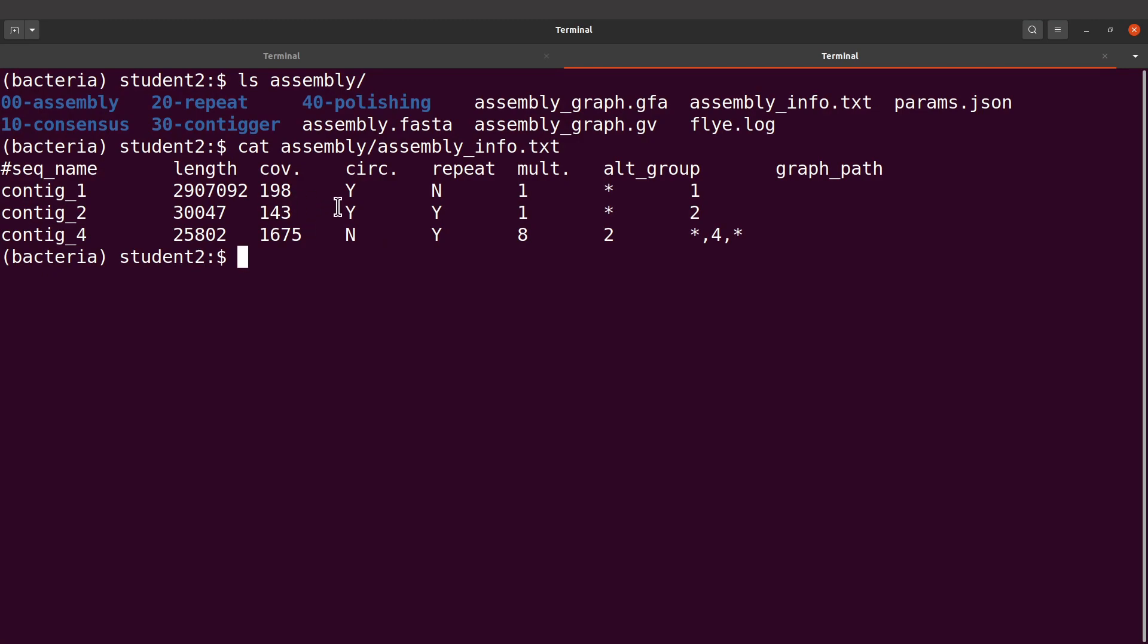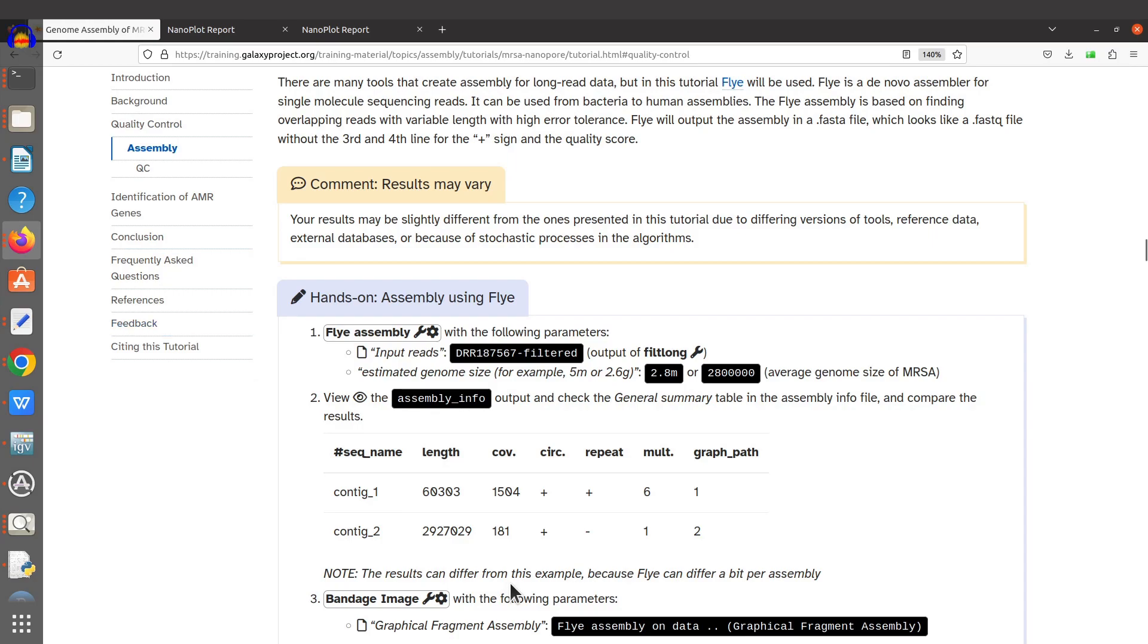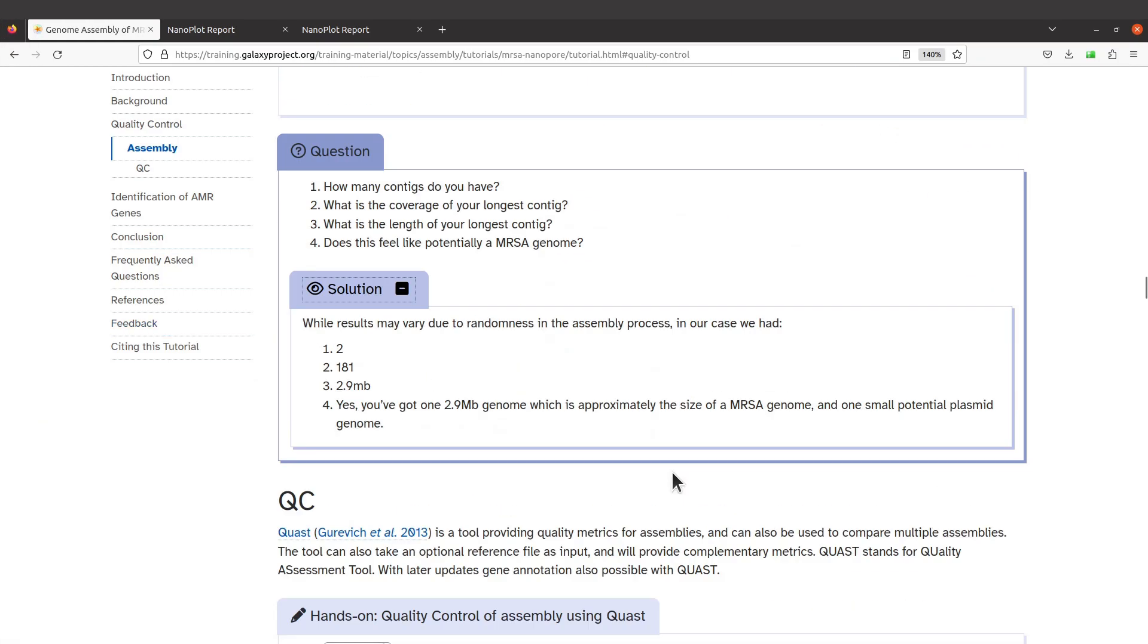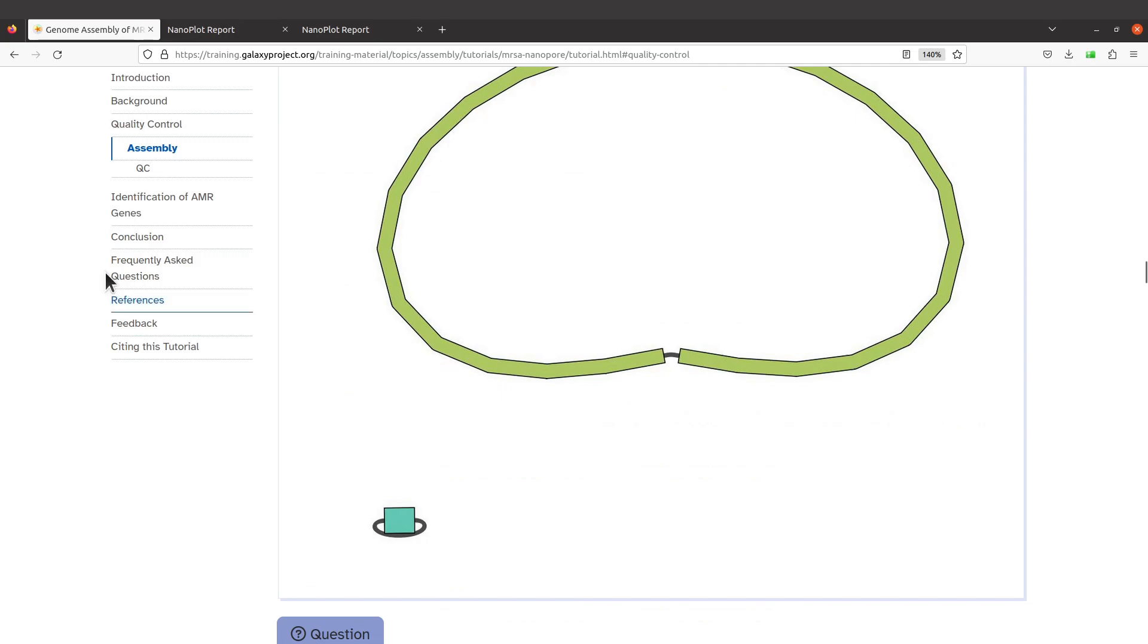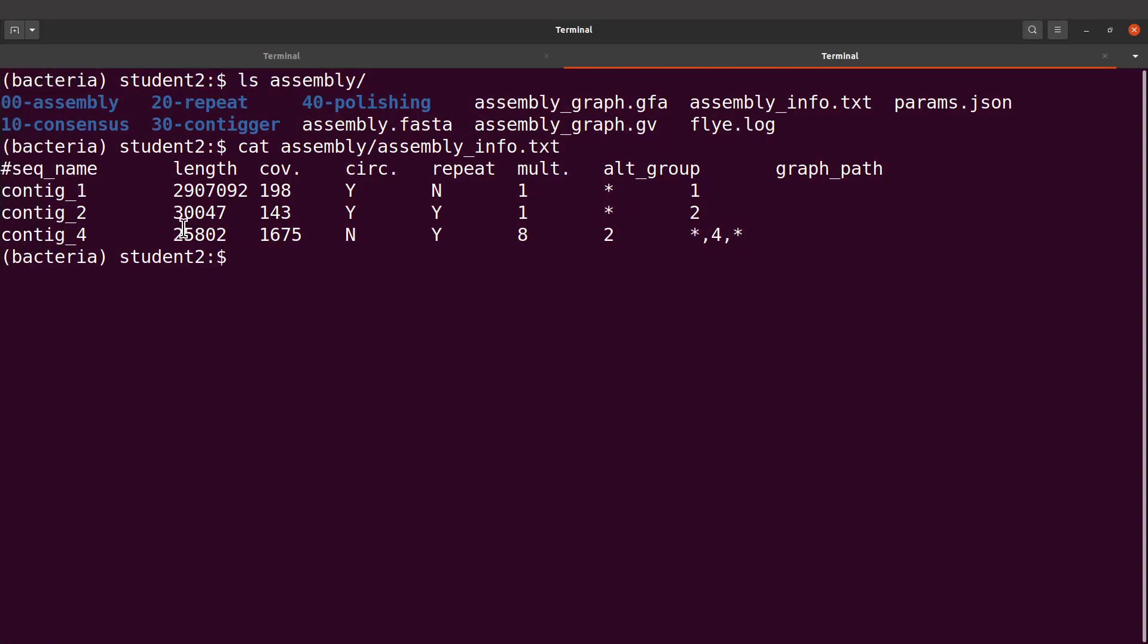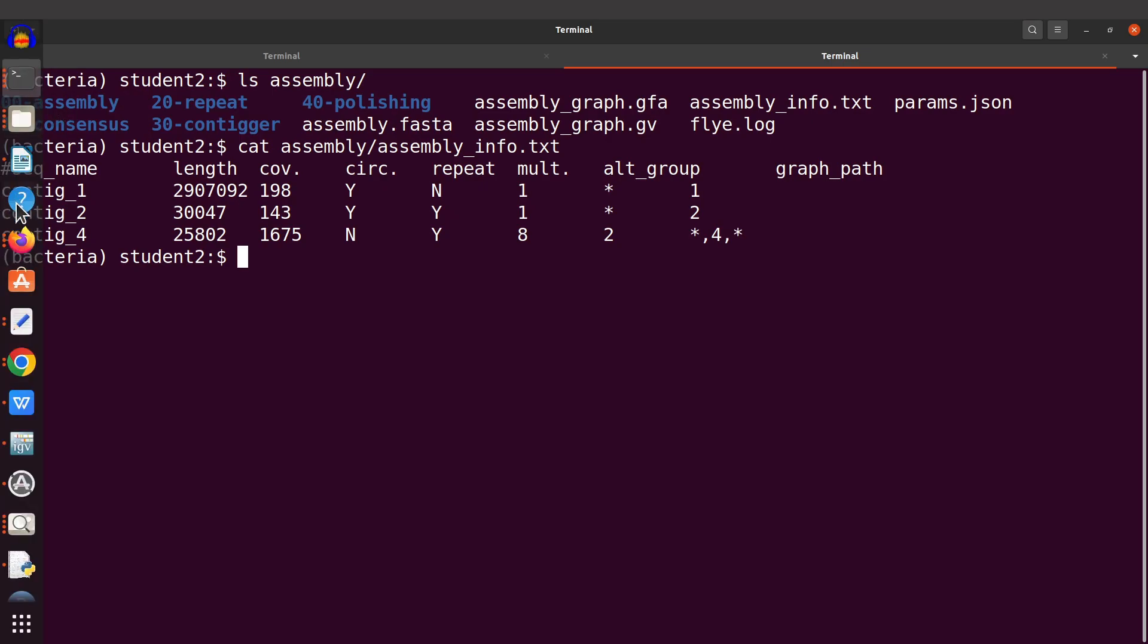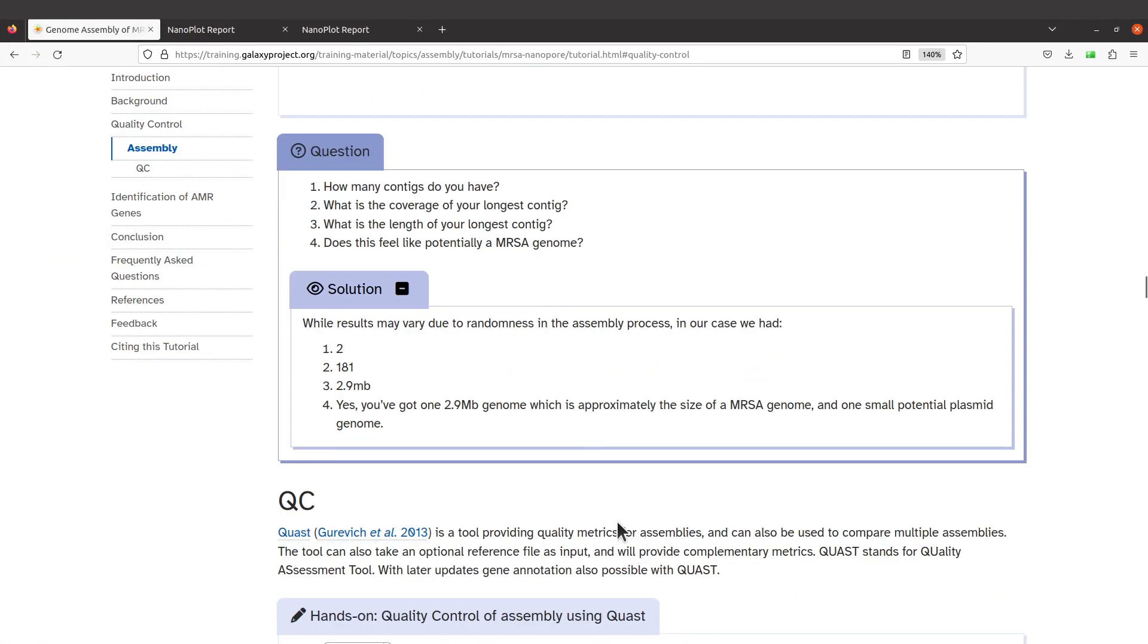What is the length of the longest contig? Here it's 2.9 Mb, and that is what we also have here, 2.9 Mb. That's the longest contig. Does this feel like potentially an MRSA genome? Yes, and the answer is because we have a 2.9 Mb genome, which is approximately the size of an MRSA genome. That's Staphylococcus aureus.